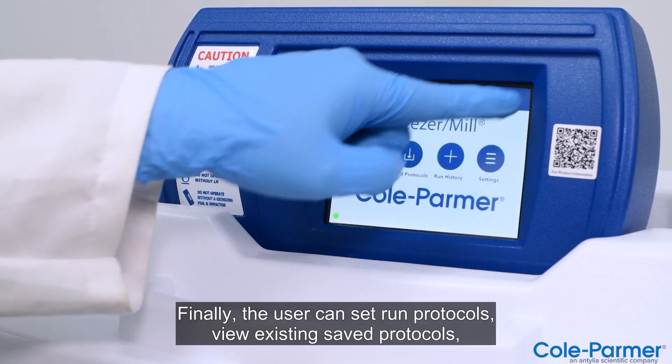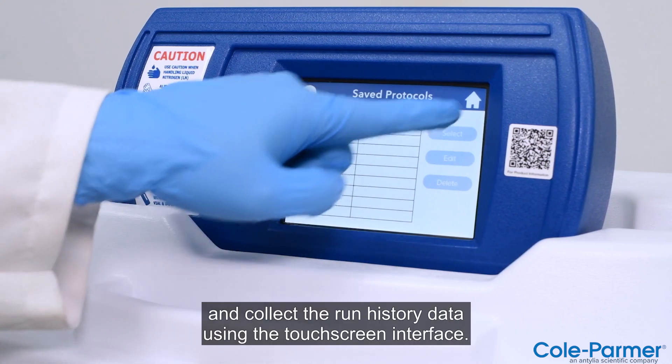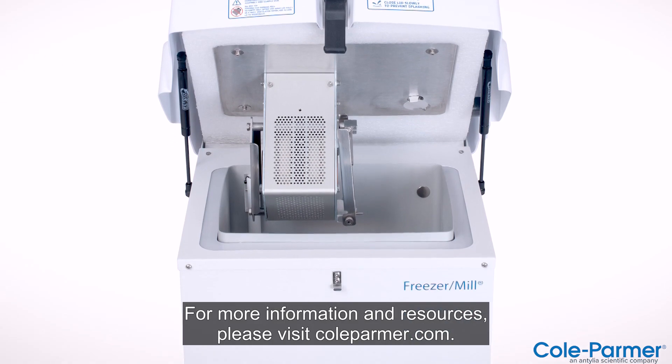Finally, the user can set run protocols, view existing saved protocols, and collect the run history data using the touchscreen interface. For more information and resources, please visit ColeParmer.com.